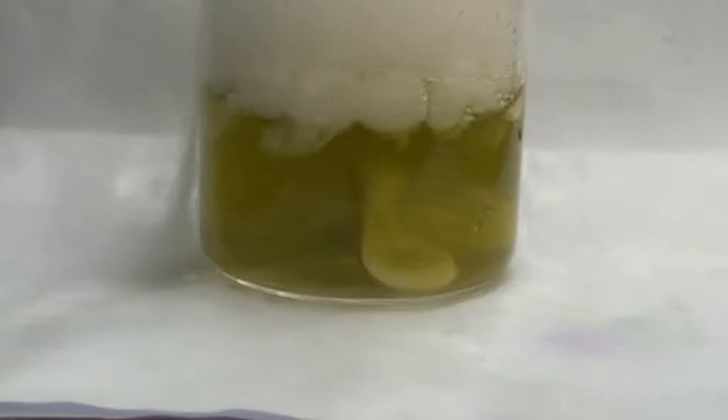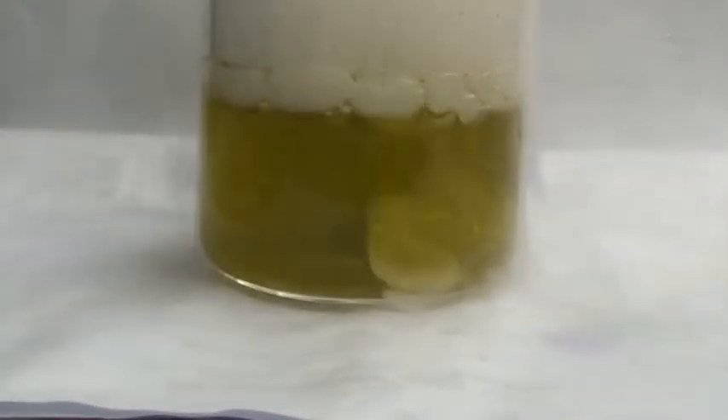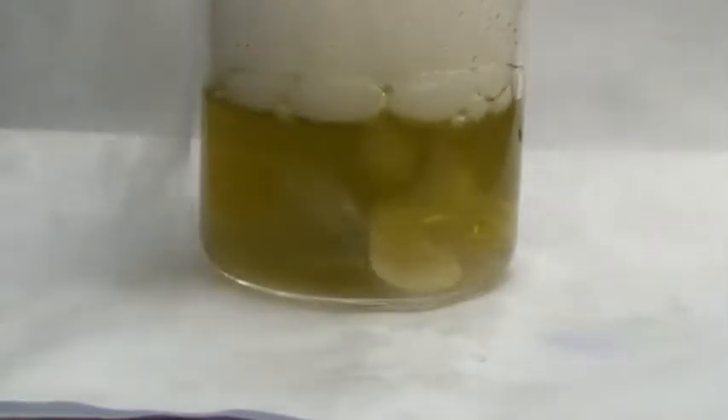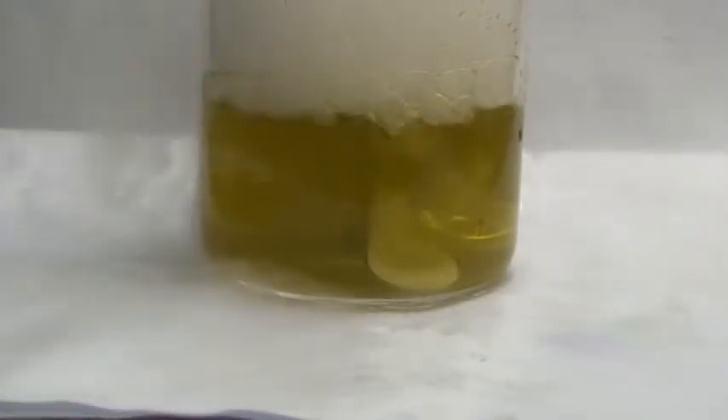When there's enough ice forming around it, the whole solid carbon dioxide will be lifted up because it floats — the net density becomes less than that of water. But solid carbon dioxide has a density greater than that of water, that's why it is initially sunken. And now you don't see the precipitate at all.